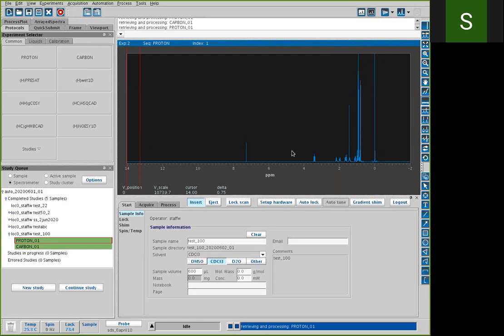In this case, as long as most all your peaks are the same size or larger than your chloroform proton peak, you can often get a carbon spectrum in a half hour. Once they get smaller than the chloroform, you should move to the Prodigy 500 for a carbon. So both of those ran well, and you're ready to take your sample out and log out.